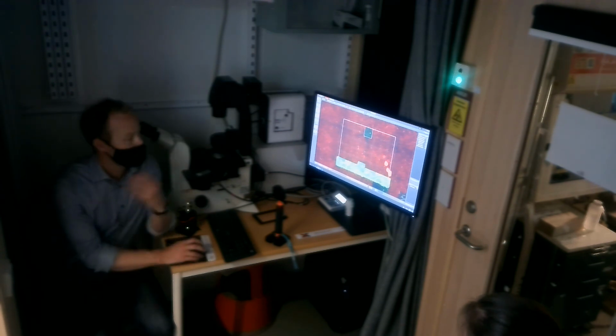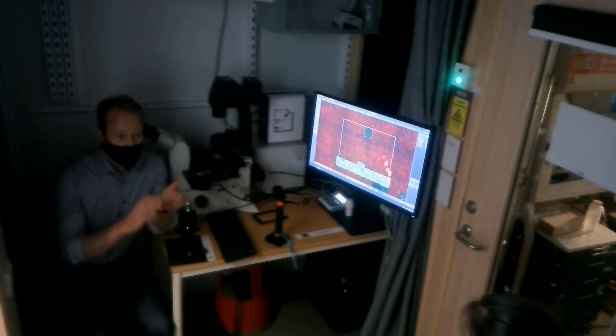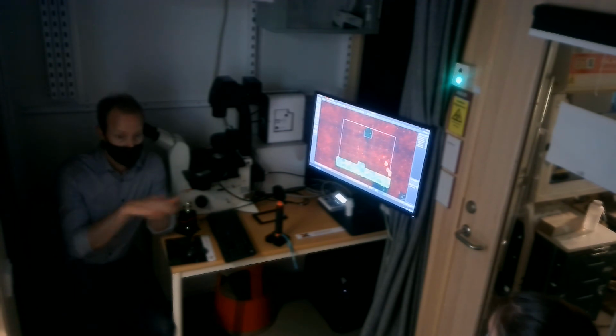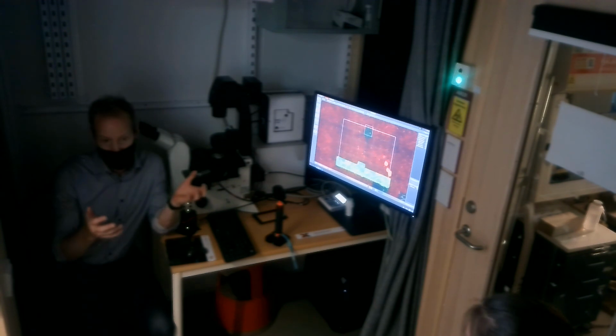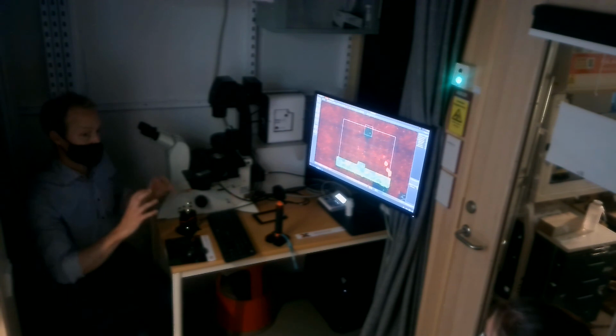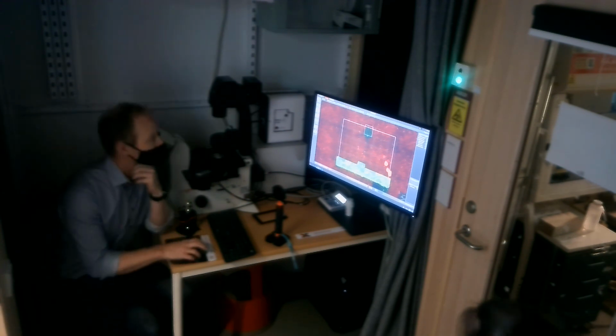I had a user I was working with last week, and she wanted to use the bright field to set the focus, but she wanted to capture fluorescence. But she also knew how her cells looked when the fluorescence was in focus. So she could focus it so it didn't look, in my eyes, like the sharpest, most focused position. But that's when she knew that then my fluorescence is focused and it worked. So you can absolutely do that. But then it will only work when you do it manually, because the computer would find a different position.